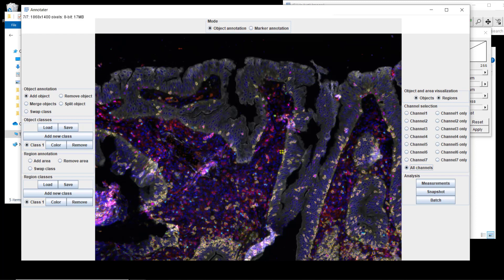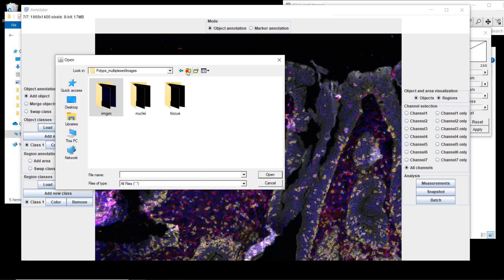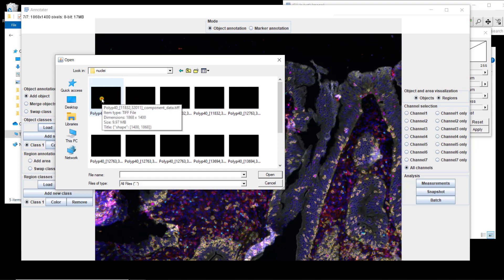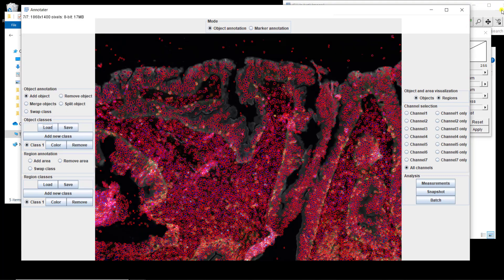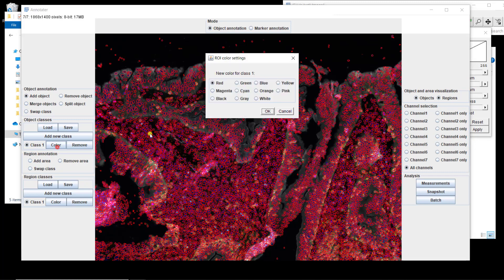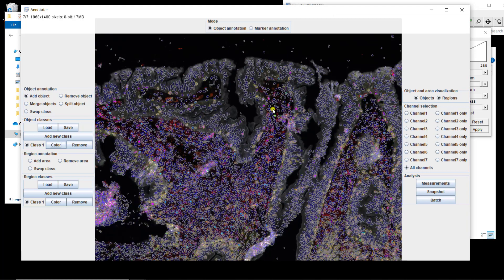I'm going to load the nuclear segmentation. I can go to the object classes panel, hit 'Load', and select the corresponding nuclear segmentation. It loads pretty fast. I like to put the segmentation in red when looking at DAPI in black and white, but when looking at all the marker channels it's harder to read, so I'll put it in gray — I find it easier to look at.